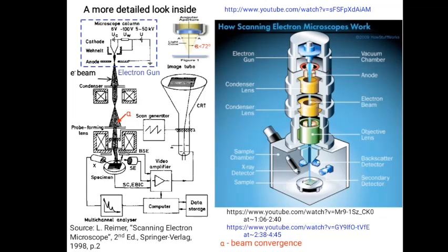Now the tungsten filament, that is a tungsten wire, is heated to produce electrons. The tungsten wire is generally in an inverted V shape. Now solid state crystals, these solid states of various materials produce high brightness images and have a longer life than the tungsten filament.